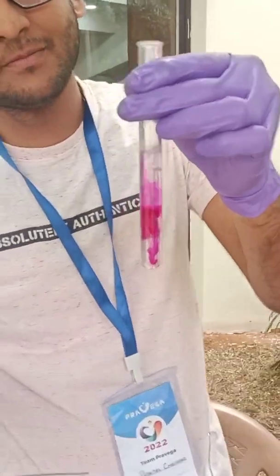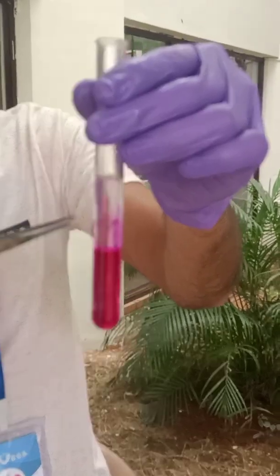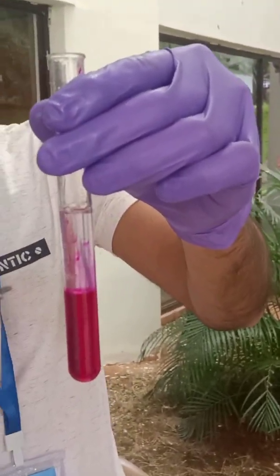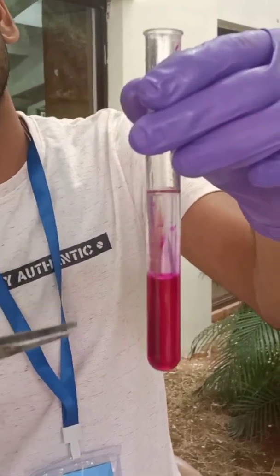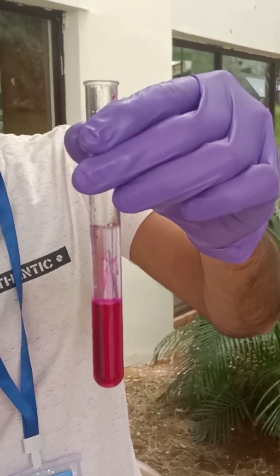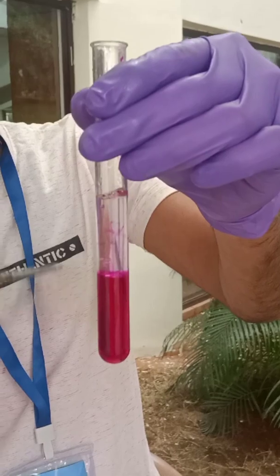It starts jumping — this is jumping sodium, producing NaOH and hydrogen gas. That's why there's a change in color of phenolphthalein. If I do it in a normal atmosphere, it is very volatile and can catch fire, but due to the hexane, it is very controlled.